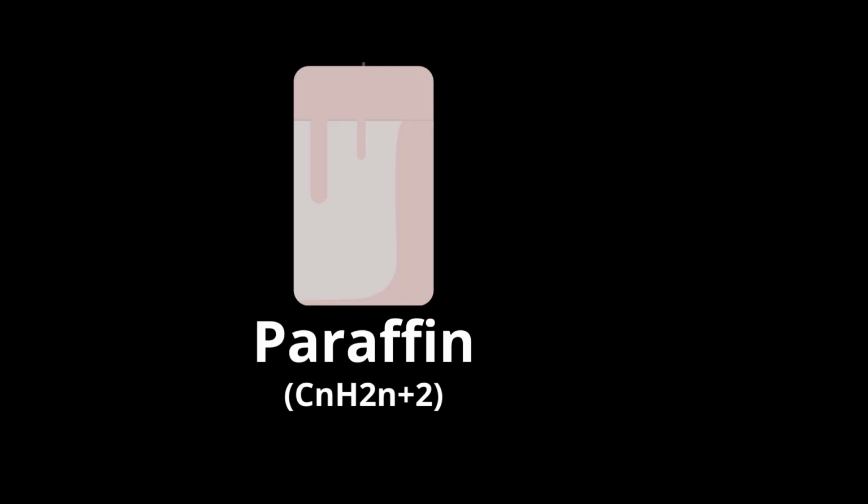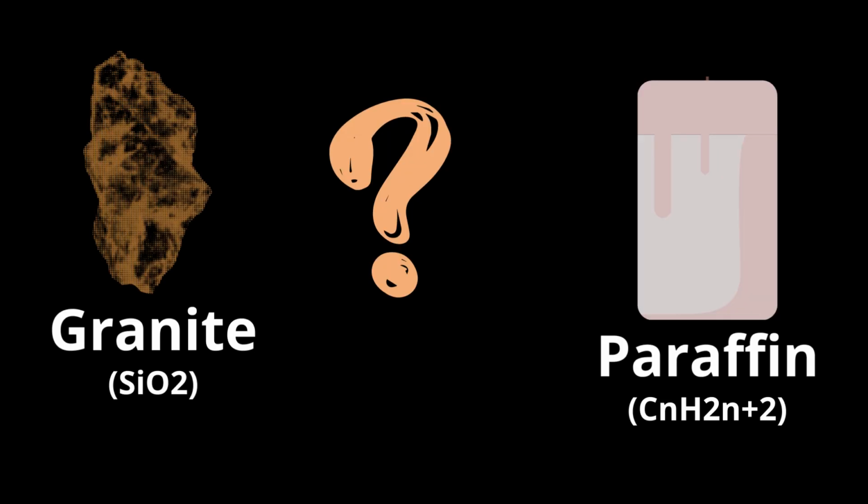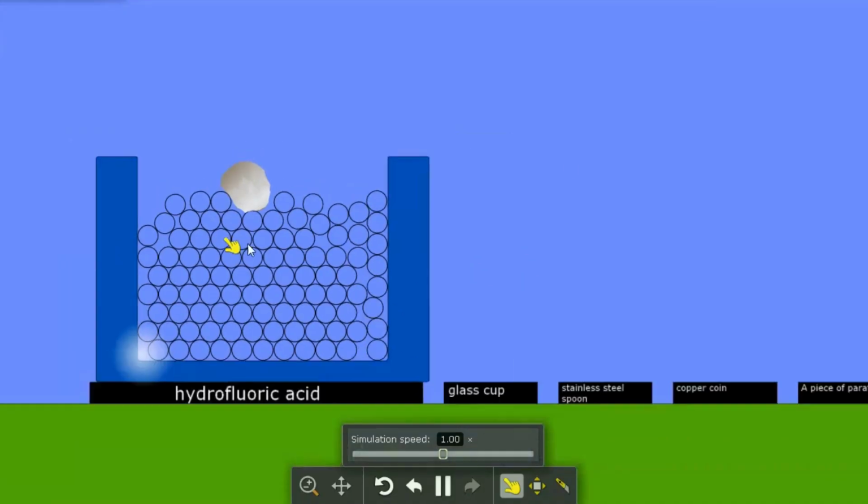Now let's compare two materials that seem completely different, paraffin and granite. Paraffin is an organic substance that consists of hydrocarbons, CnH2n+2. Granite is a natural stone that is made up of various minerals, including quartz, SiO2. Which one do you think will dissolve in hydrofluoric acid? If you think that paraffin, then you are mistaken.